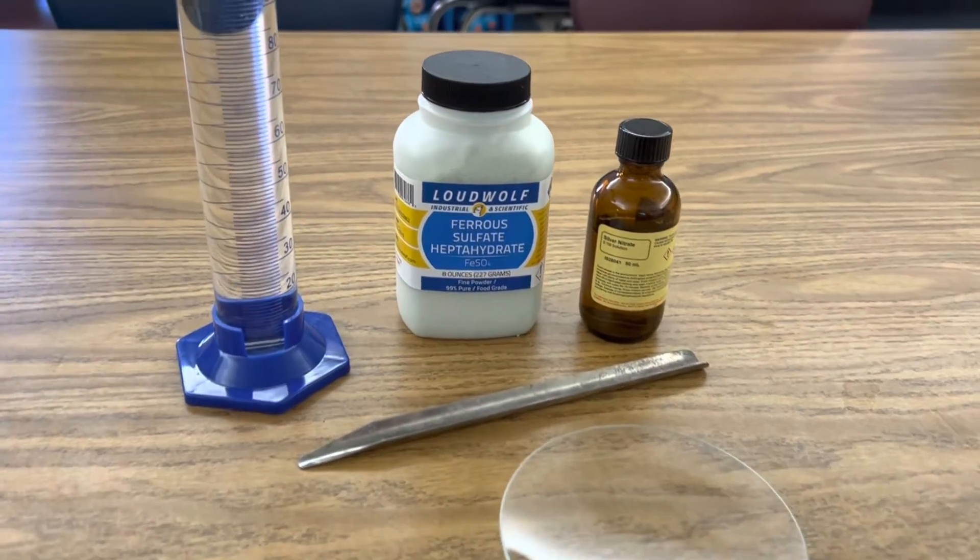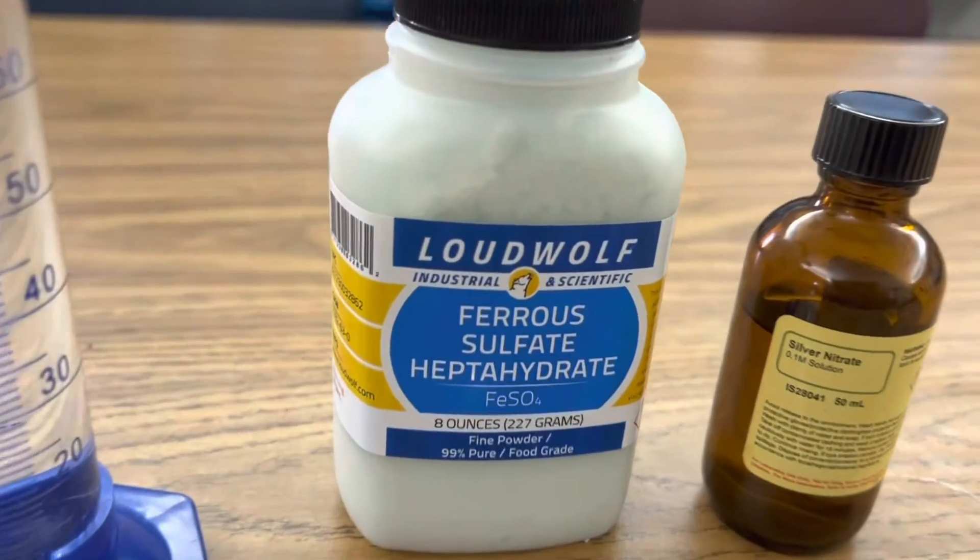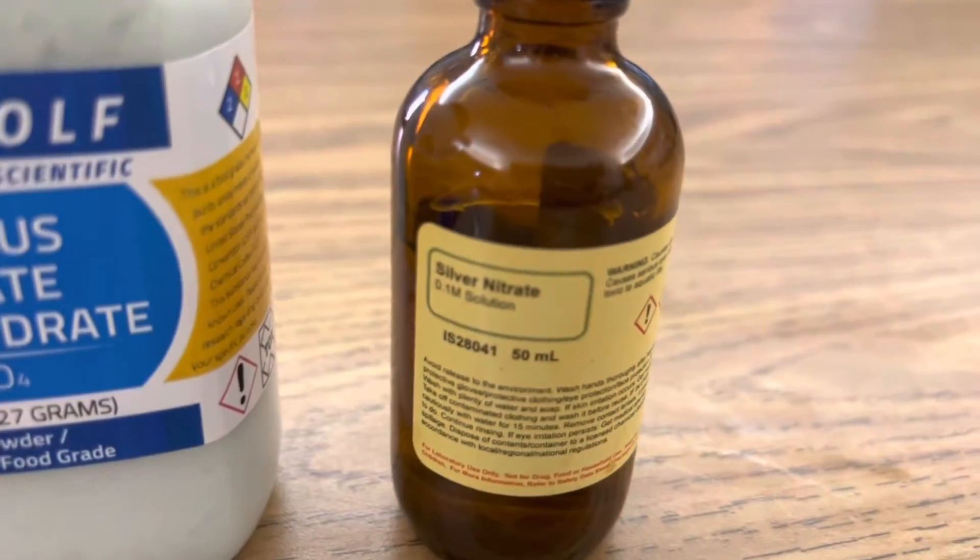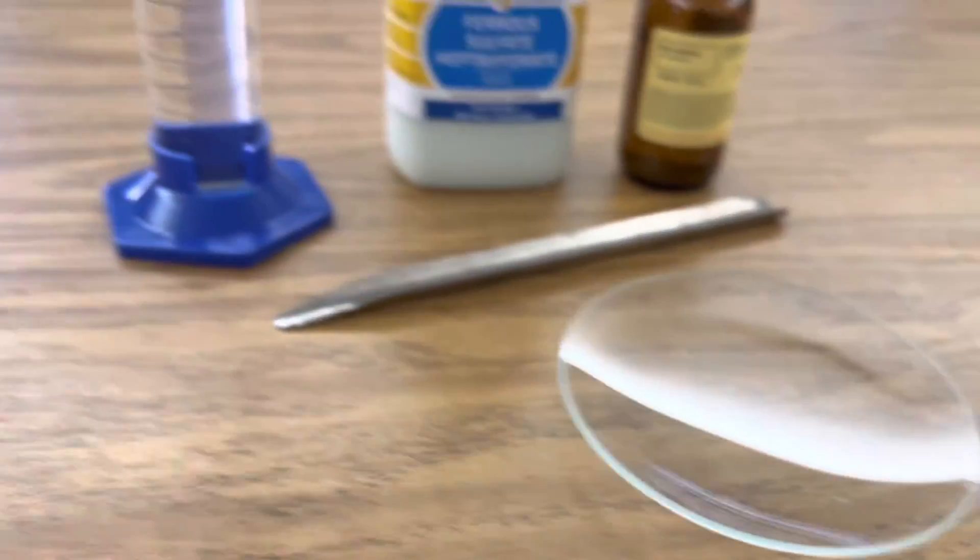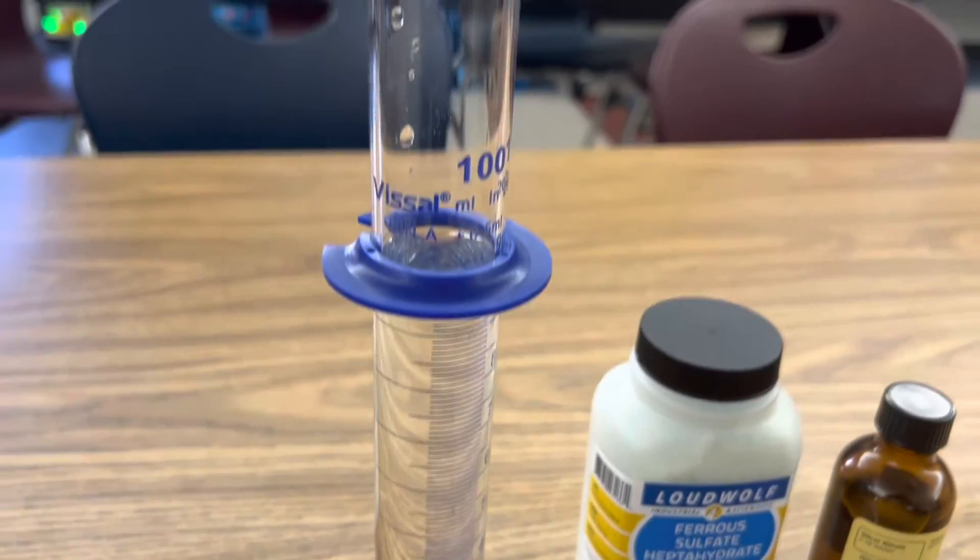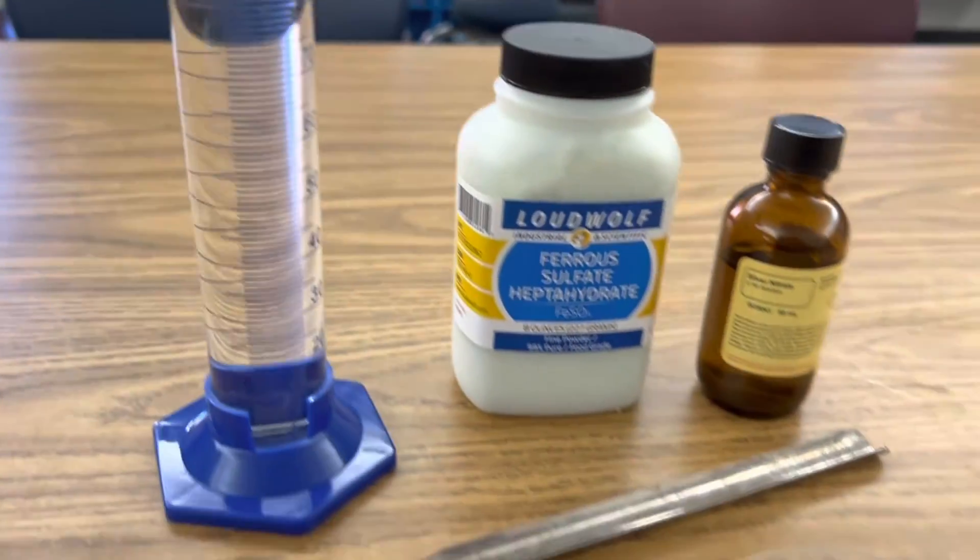All I'm using in this investigation is ferrous sulfate, also known as iron sulfate, silver nitrate, a watch glass spoon, and a hundred milliliters of distilled water in this graduated cylinder.